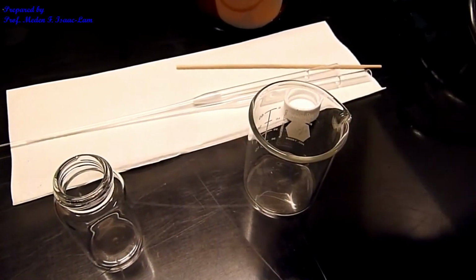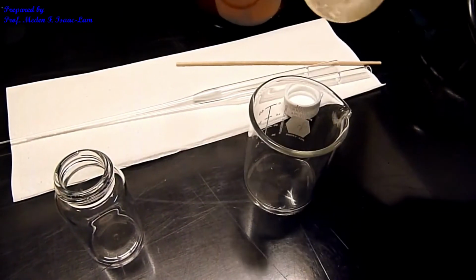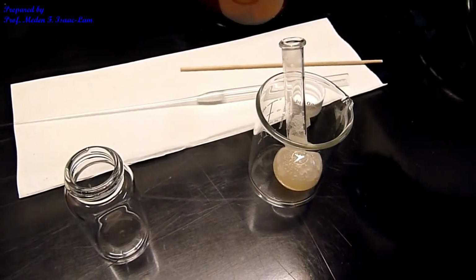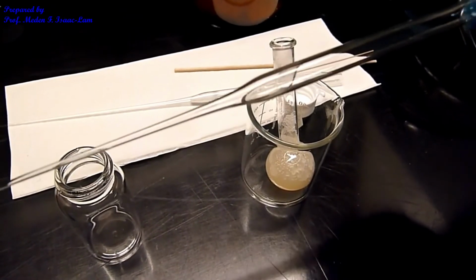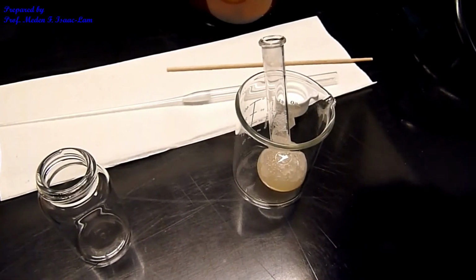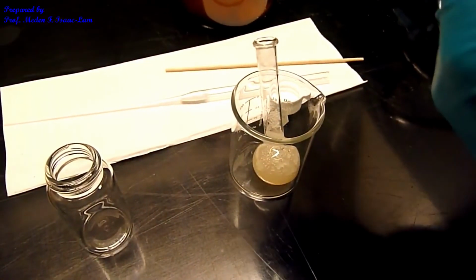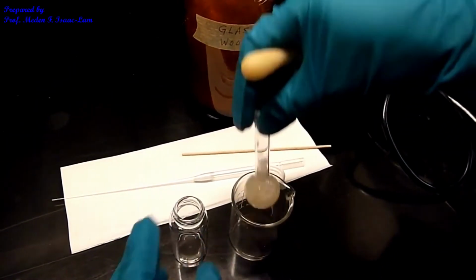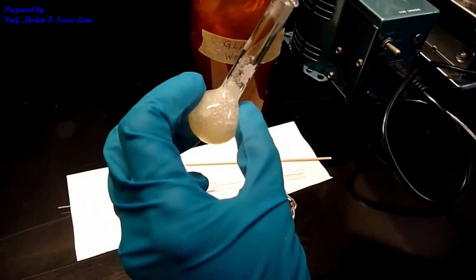So this is our reaction mixture over here. And I'm going to use the pipette without the glass wool. And I'm going to use a bulb. So I put the bulb in here. And then I'm now going to pipette. So I will take the liquid.